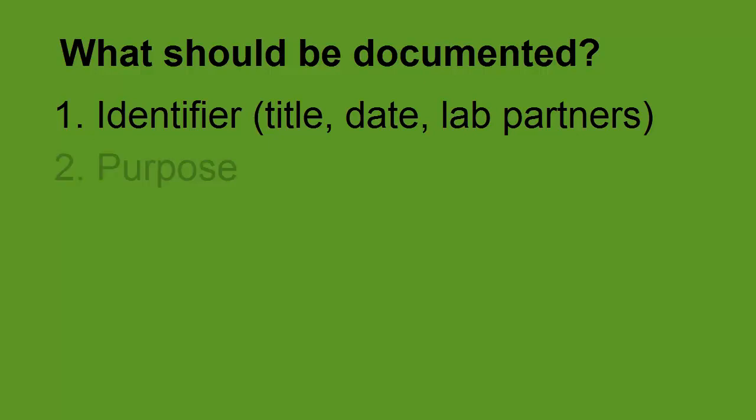Next, we want to make sure that there is a purpose statement. In other words, a very succinct statement that tells the reader why you performed the experiment. This can be very handy when trying to determine what the motivation was for performing a given experiment.